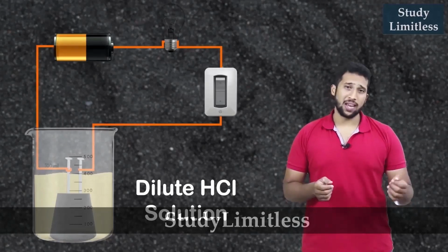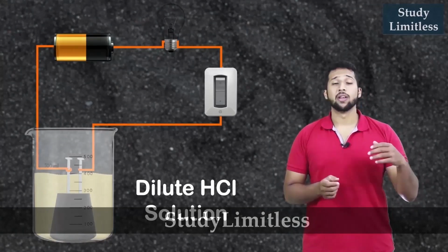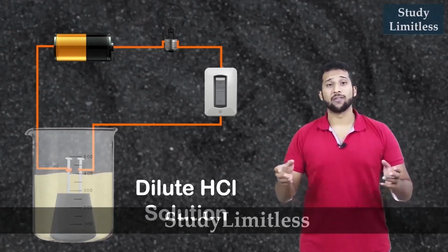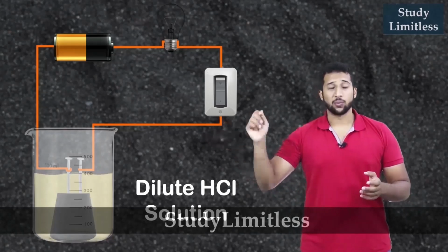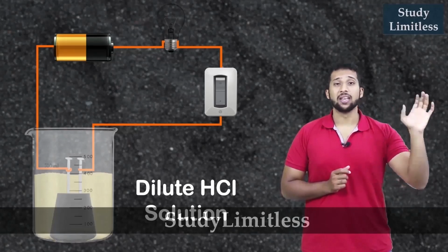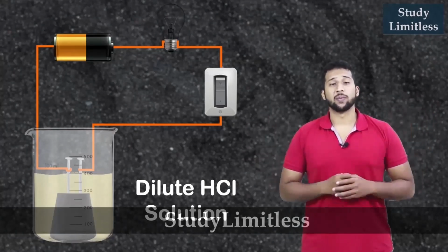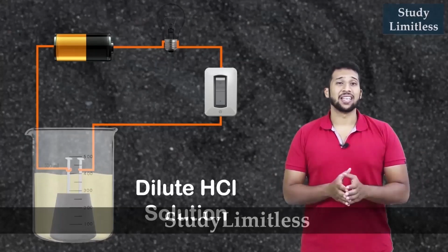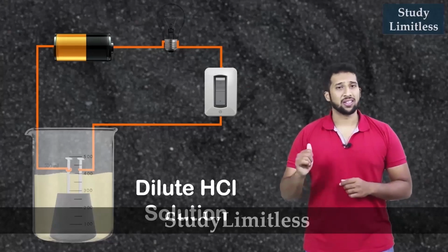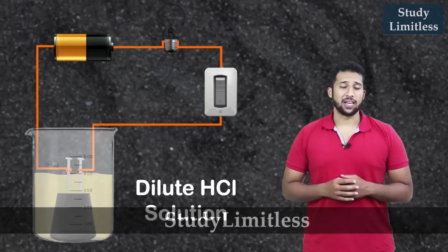We're going to tie one end of one iron nail to a wire, and the other nail we're going to tie to another wire which will go to the switch, and one end of the other wire would be connected to a 6-volt battery. This whole circuit would be completed by placing a light bulb which is connected. Now we're going to turn this on and observe what actually happens.